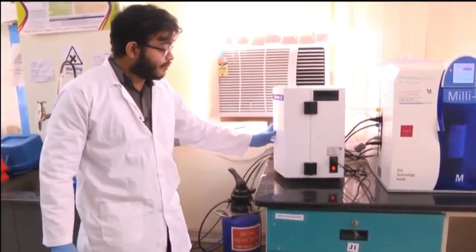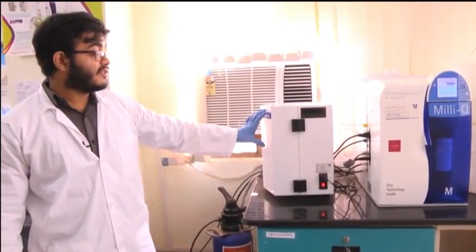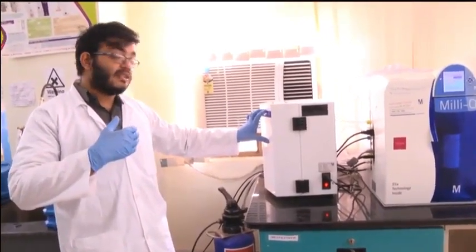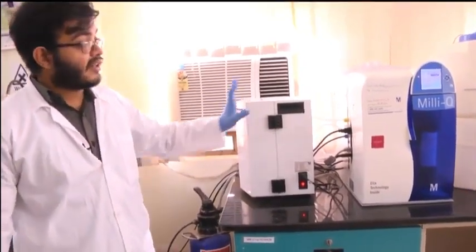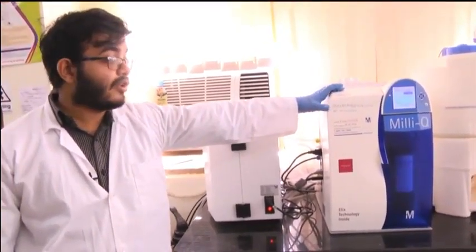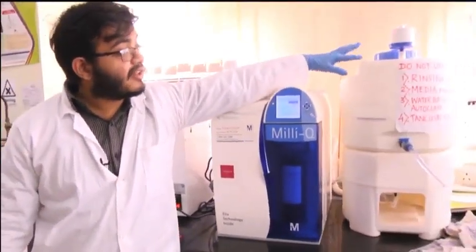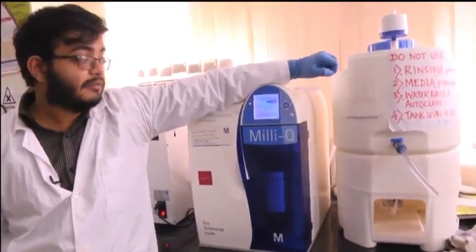Apart from that, inside this component of the water filtration system, there are filters having pore sizes of maybe 5 micron or 2 micron or both, and what they do is they remove the large size particles, they remove the sedimented particles, they remove impurities from the water. Apart from that, inside this machine they carry out the deionization, so they remove all the ions using different expensive membrane filters, and finally the purified deionized water is stored in this tank from which we can take as per our requirement.